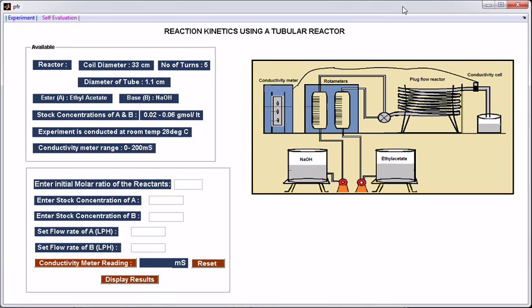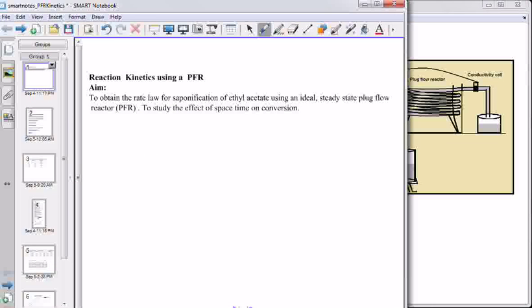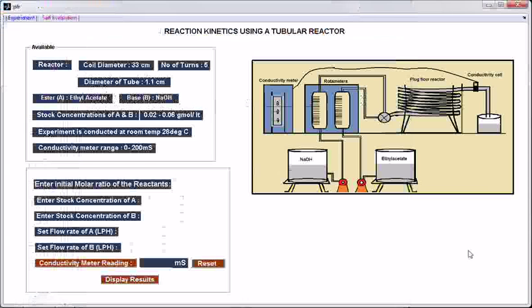Welcome to Virtual Labs at National Institute of Technology, Karnataka. In this tutorial, I'll show you the experimental procedure for reaction kinetics using a tubular reactor. The aim of this experiment is to obtain the rate law for saponification of ethyl acetate using an ideal steady-state plug flow reactor and to study the effect of space-time on conversion.